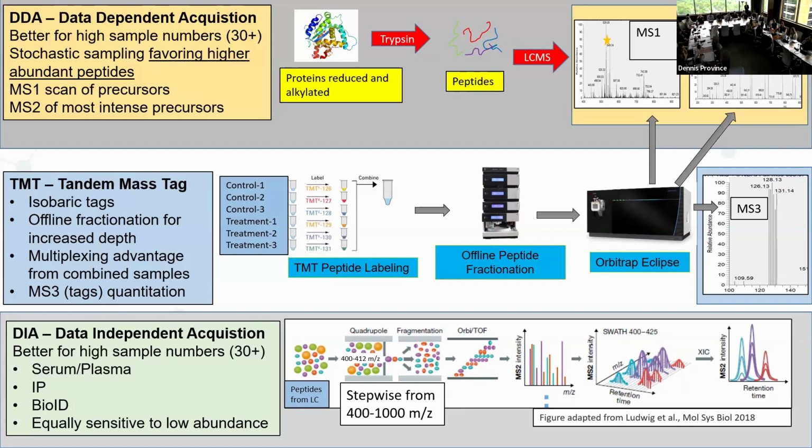So we're going to spend some time looking at the difference between DDA, or data dependent acquisition, versus DIA, versus TMT.